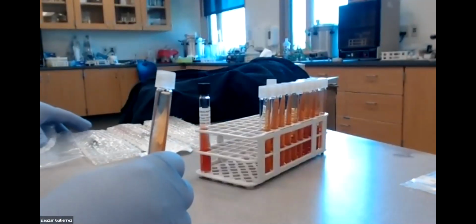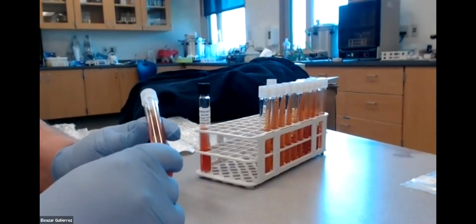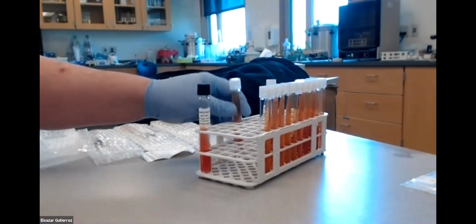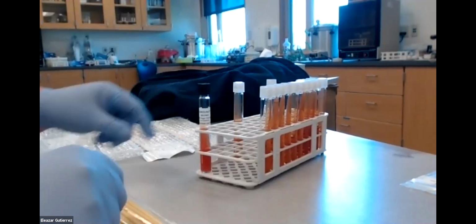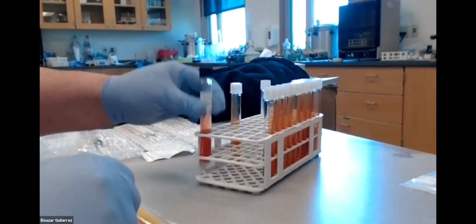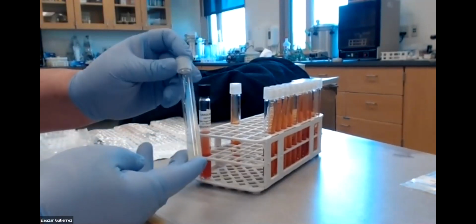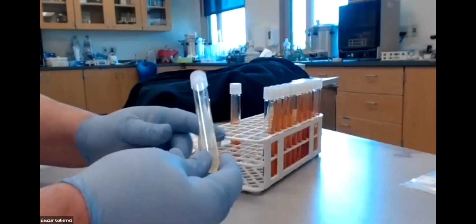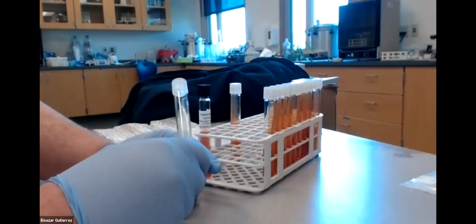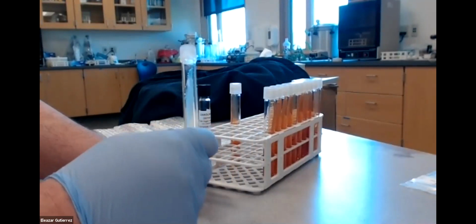I think your kit comes with 3 of them because you're going to do three different organisms. So you're going to need your loops, you're going to need your TSI, and you're going to need your 3 cultures. Okay, I'm going to demonstrate using E. coli, a slant. Can you use a broth? Absolutely. Can you use a slant? Yep. Can you get it from a petri dish? Yep. At the end of the day, it really doesn't matter.